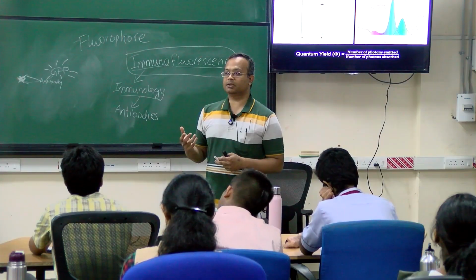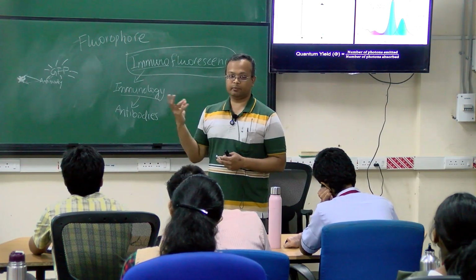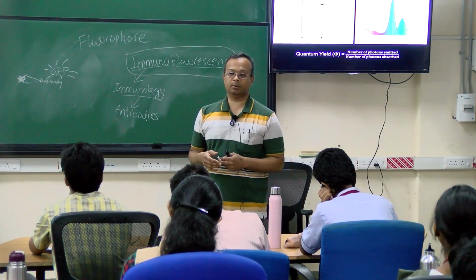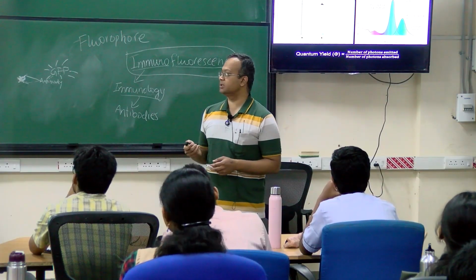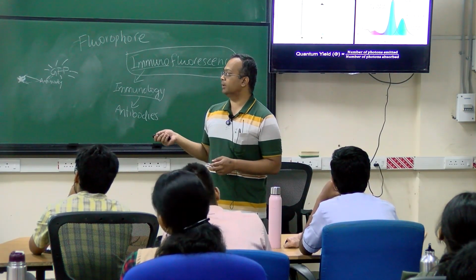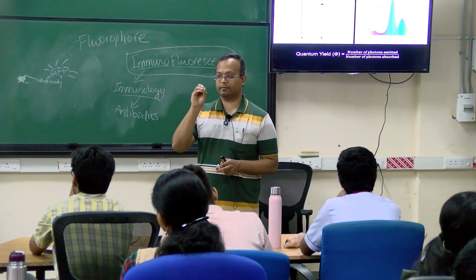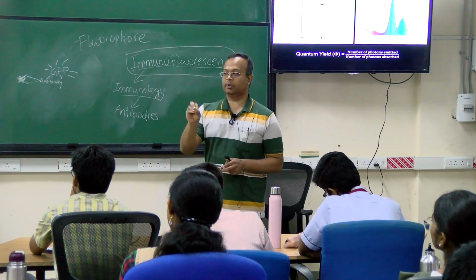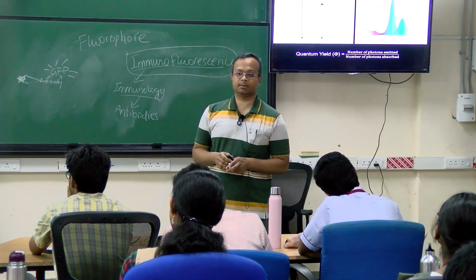For our real world application, we may need fluorophores with much higher quantum yield. So people do a lot of chemistry and a lot of designing of chemistry to achieve materials of higher quantum yield, so that even with a few photons of light that you give, you will get a huge amount of photons that are released.